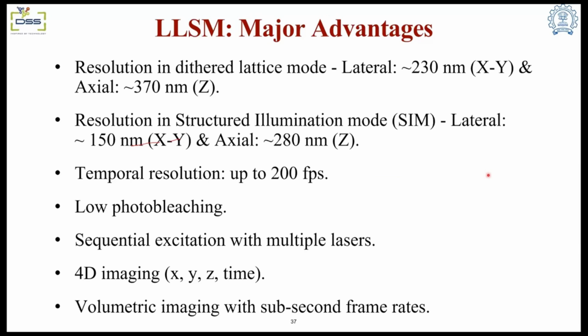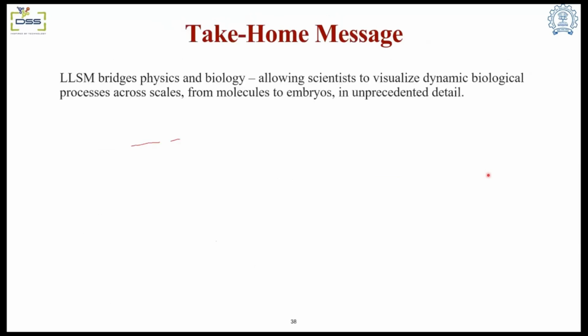So in this, I would like to conclude that the lattice light sheet microscope bridges physics and biology, allowing scientists to visualize dynamic biological processes, at scales from molecules to embryos, in unprecedented detail.